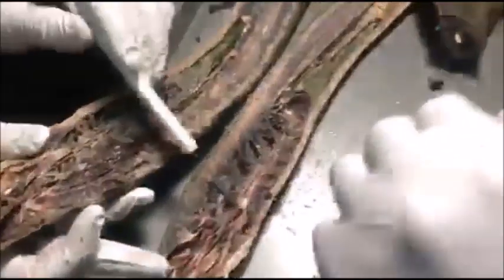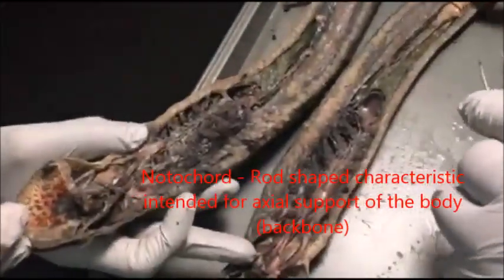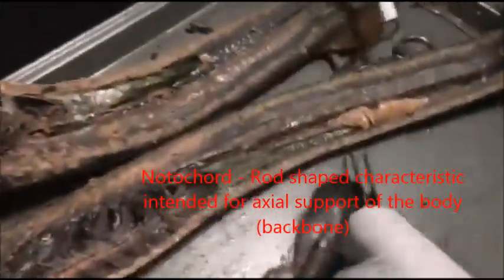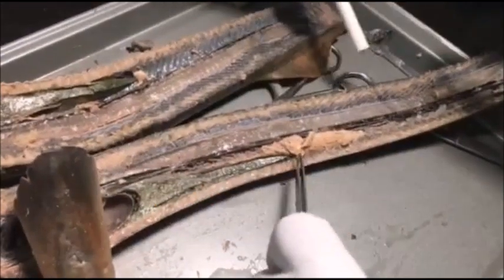Under the myotomes we have the notochord, which is basically the backbone of the fish and is made of cartilage. Finally, we have the intestines down here.